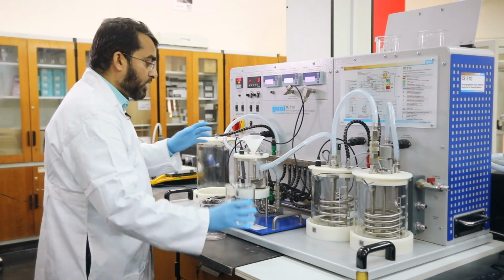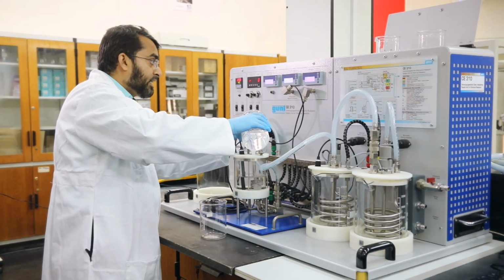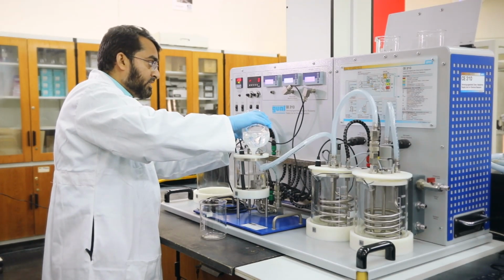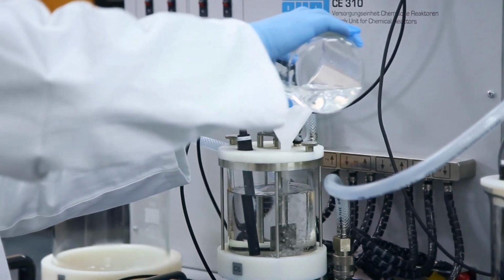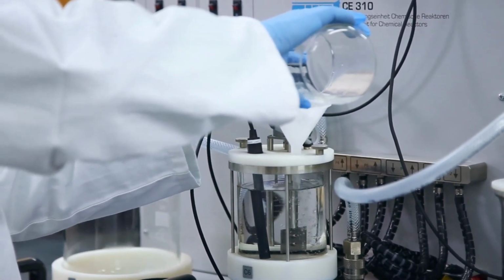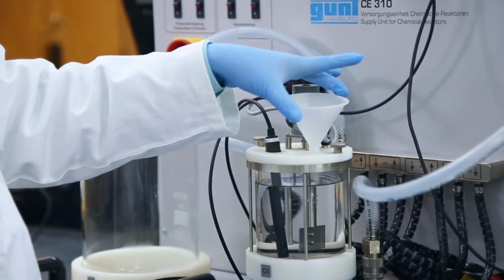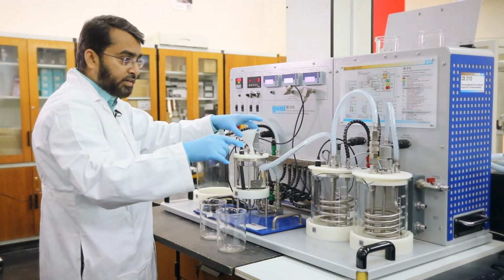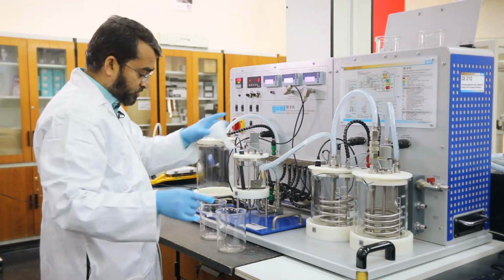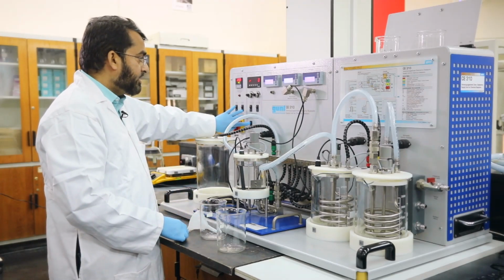So I will add this ethyl acetate now. You can see the conductivity starts decreasing because it is diluting the sodium hydroxide, and after mixing it will be almost half of the previous value. You can see the data is already being taken by the software, and then we start the stirrer.